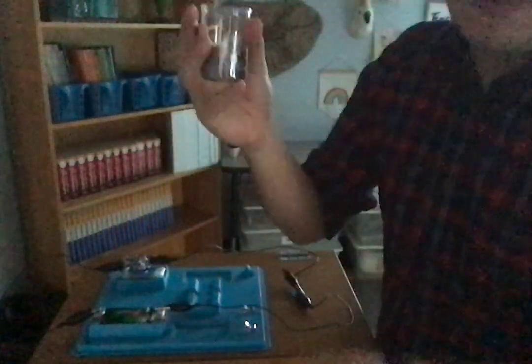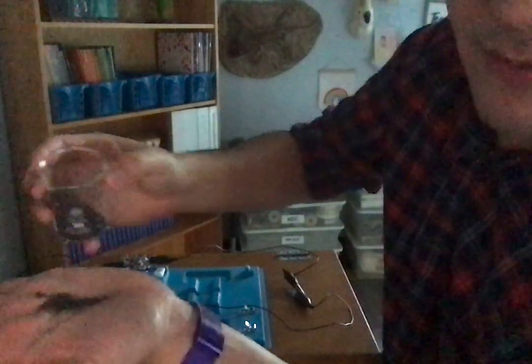And then last but not least, we're going to use another powder. This powder is called iron filings. So it's a black powder. It kind of looks like pepper, the kind that you put on your food, but you don't want to eat this kind because this material is made out of tiny pieces of iron. So it's like powder that's made from iron. Let me see if I can pour some out so you can see a little bit better. Boom, boom, boom, boom, boom. Oh gosh. Do you see the powder?